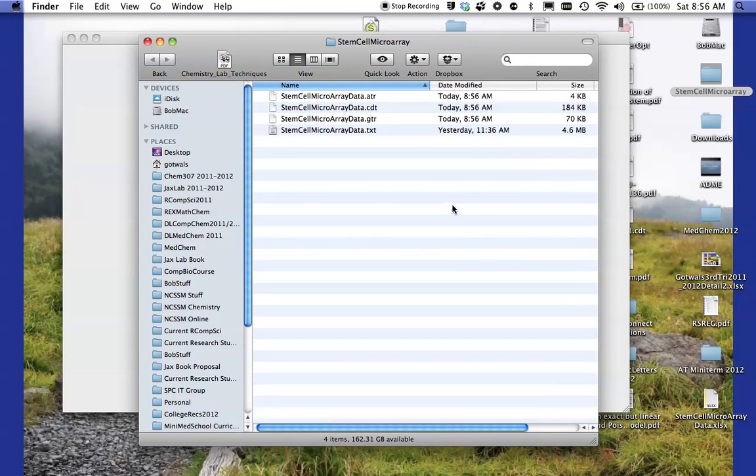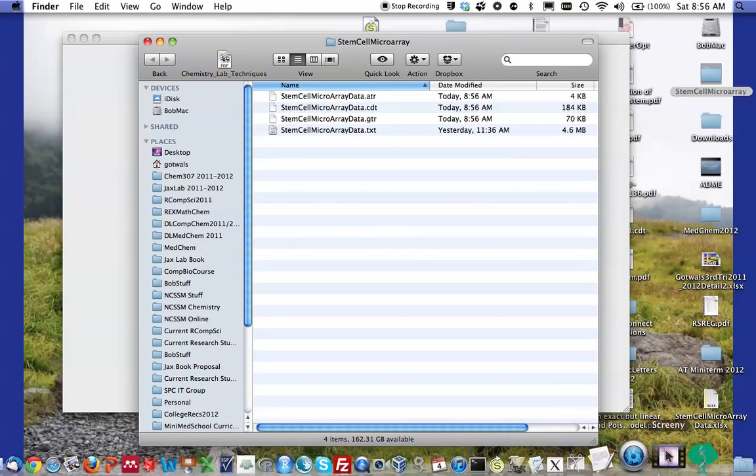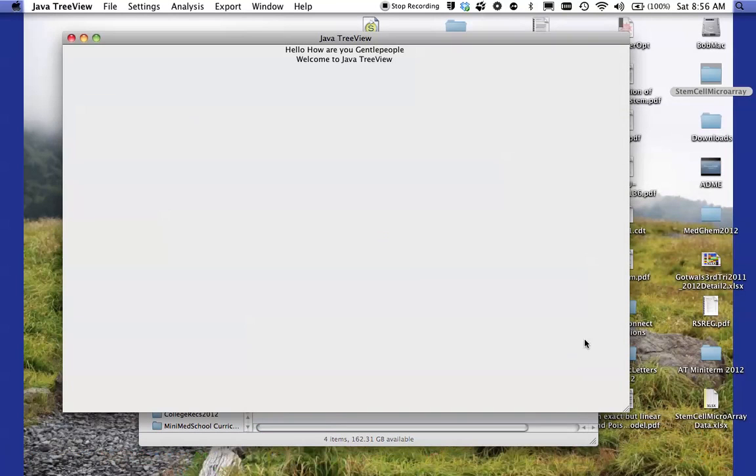And what you should notice now in your folder, and again, it's a really good idea to put all this stuff in a folder so you can find it, I now have three other files. I have an ATR file, a CDT file, a GTR file, and then of course my original text file. At this point I'm going to go to Java tree view and I'm going to open that.